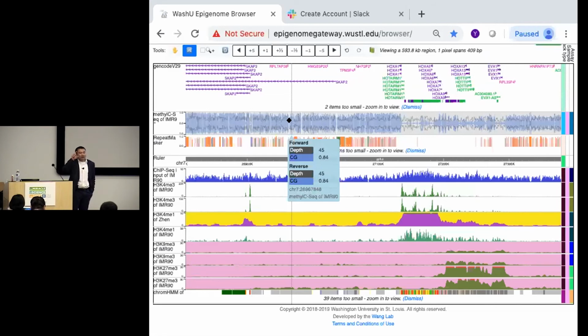We added a background color for CpGs with read coverage. So now you have a background color for that CpG, and the foreground color is the methylation level. If you only see the background color, this CpG is being interrogated. I have sequenced it, but the foreground is 0. That tells you the methylation level, right? So it's a very simple idea, but it actually goes a long way.